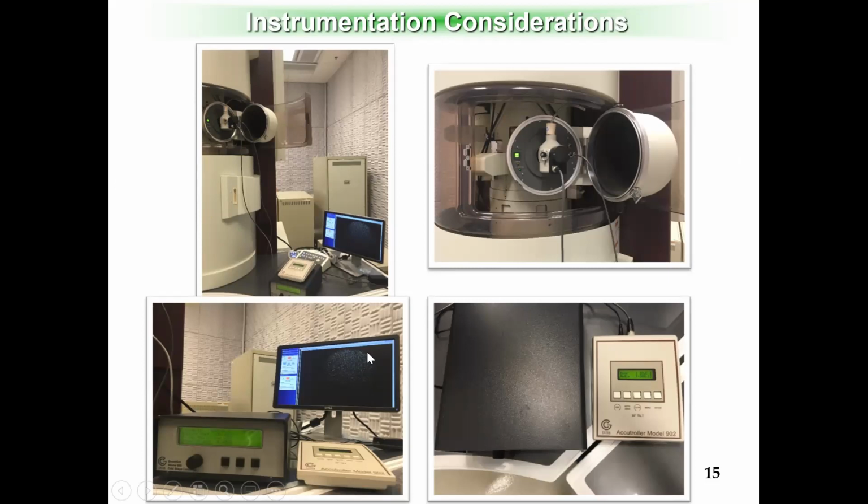And to enable cryo temperature imaging, we want it super stable, without any drifting or vibrations for very high resolution imaging. So first of all, we have to control the temperature to be stabilized. If your temperature keeps on increasing or decreasing, you cannot stabilize your imaging for sure, right? So this is the monitor for the temperature. We also need to tilt the zone axis so that we can see the atomic resolution. And the zone axis tilting is not something easy to do. It takes like a month to get experience on your specific sample.